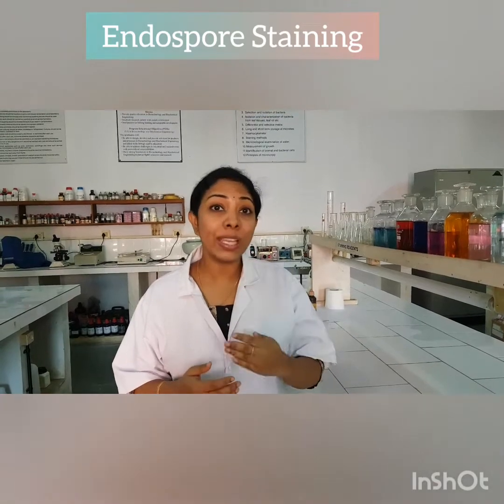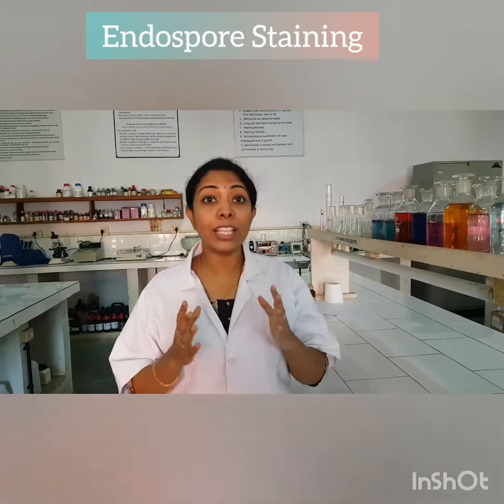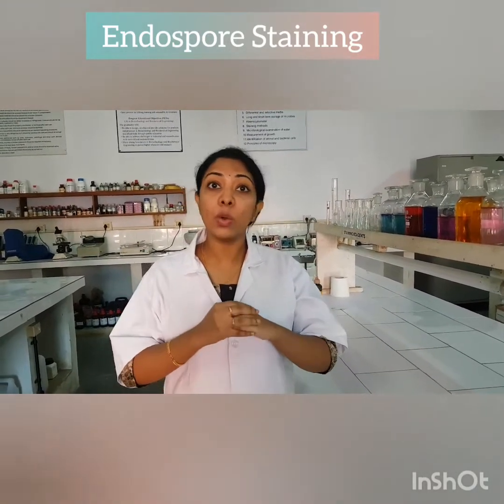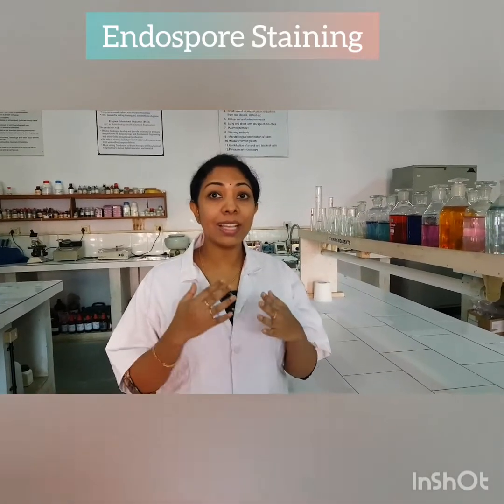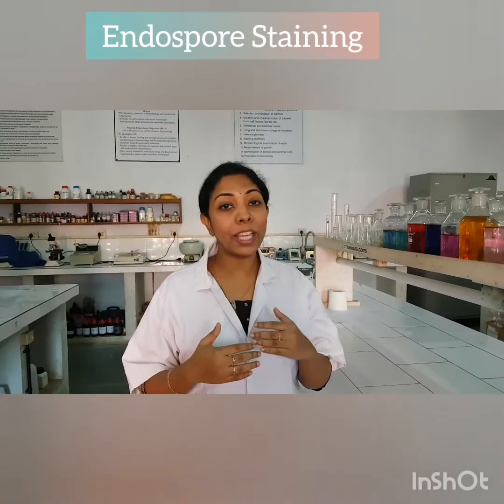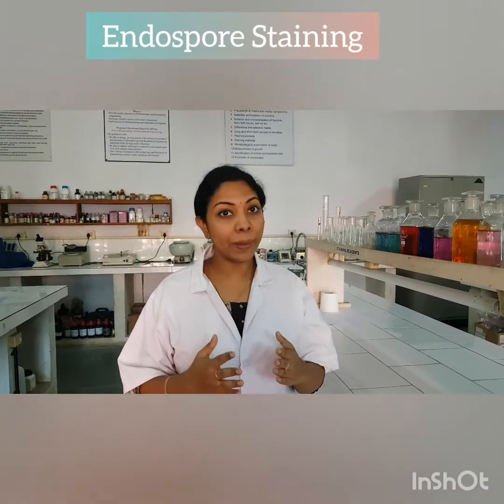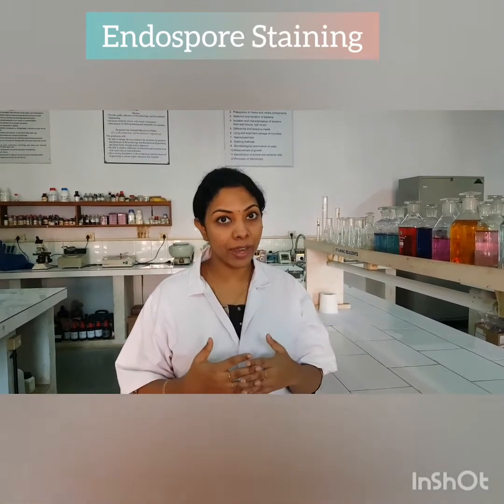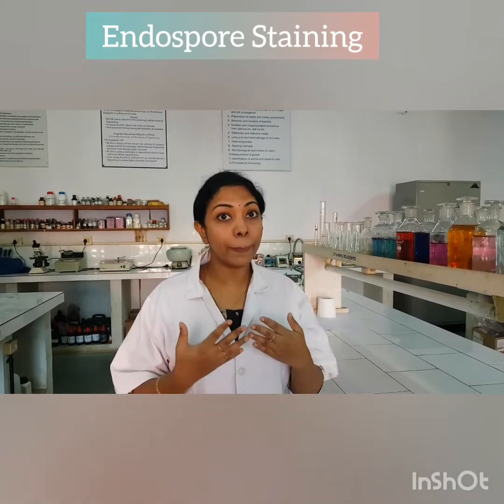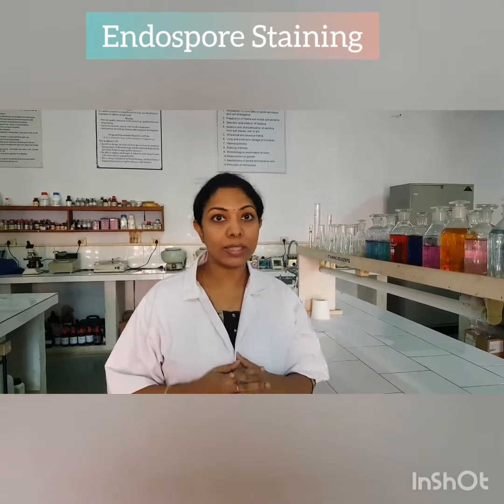Then the malachite green is soluble and has less affinity for the cellular materials, especially for the vegetative cells, so we can decolorize it with water. And these vegetative cells that have been decolorized by the water will be counterstained by the application of safranin. As a result, the vegetative cells appear pink due to the safranin counterstain, and the endospore appears bright green due to the malachite green staining.